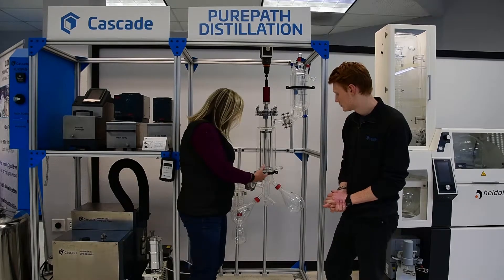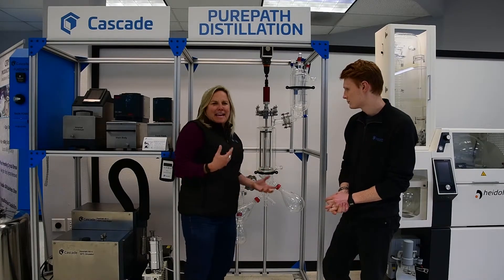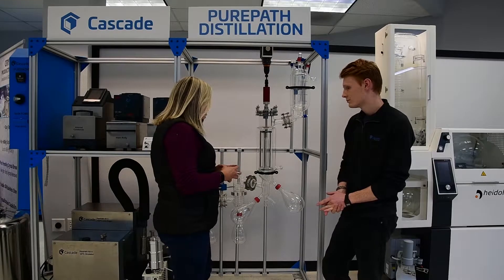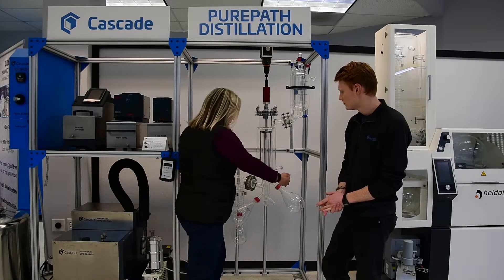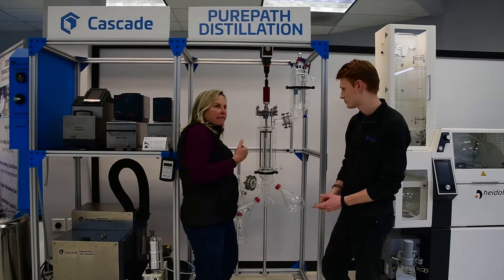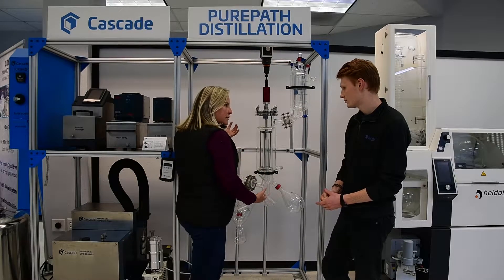I've seen people refer to these receiving flasks as the lights and the heavies. So can you talk about what the lights are when you get this separation and this condensation? What is generally landing in the heavies and what would generally be classified as the lights?